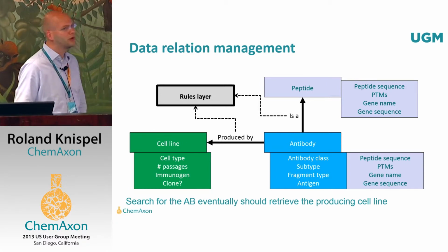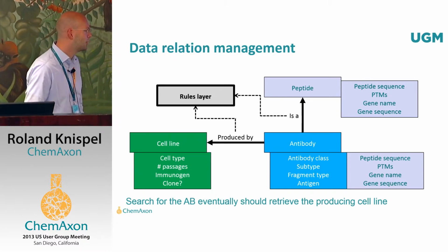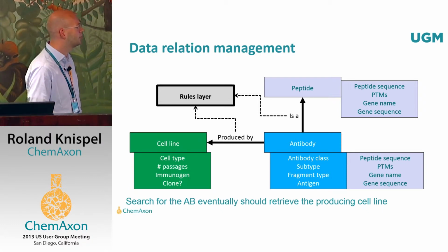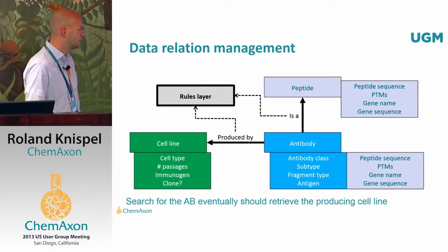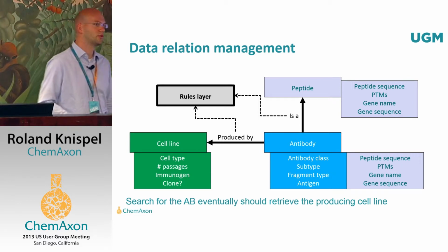The antibody, once you know about the sequence, would be registered in the macromolecule registration module that can inherit something which is just a different entity in the macromolecule registration space, which itself is a general peptide, and certain parameters or descriptors of a peptide are automatically inherited by the entity of an antibody because the antibody has peptide sequences, gene names, descriptors, and things like that.